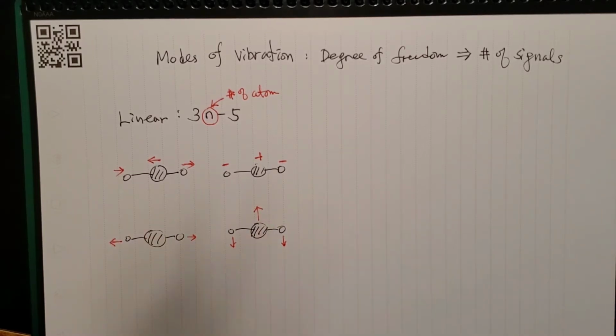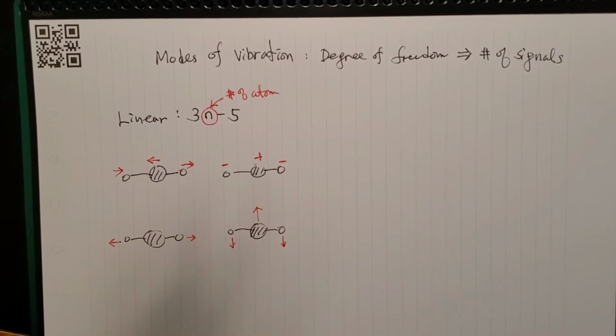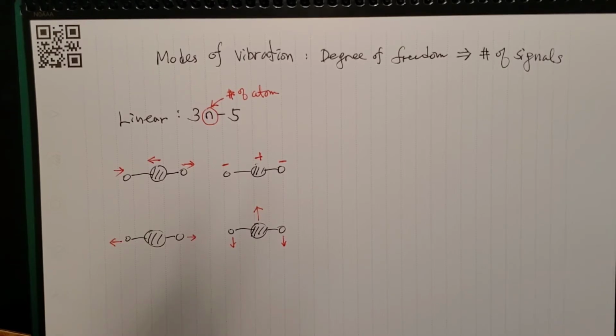So 4 signals, and they're not identical in frequency. Also, their intensity of the signal at a certain frequency is not identical either.